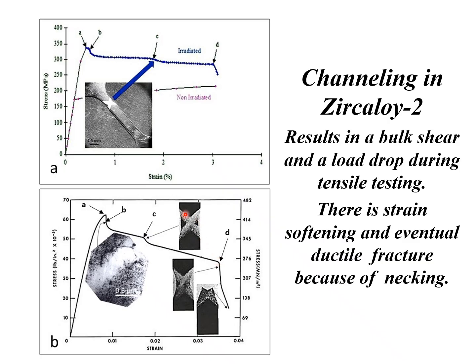So in this particular case, they're channels, and you can see the kind of messy images that you get. This is some work by Bennett. This is from Lemeño and Company. Basically, what the channeling does is that you end up with a load drop and continued strain.